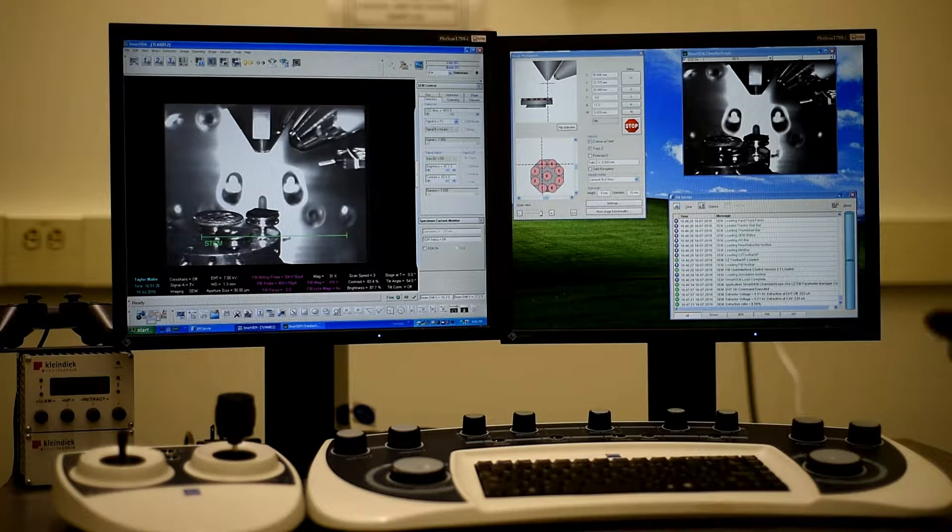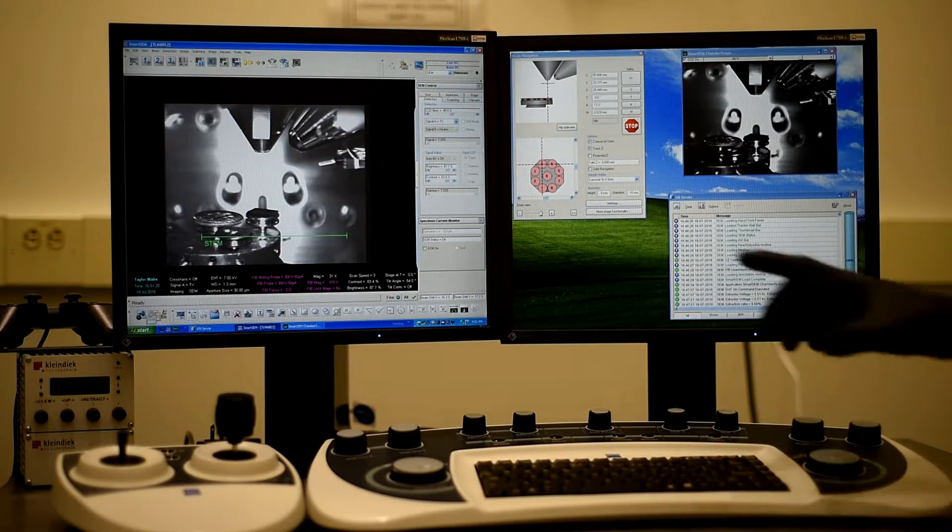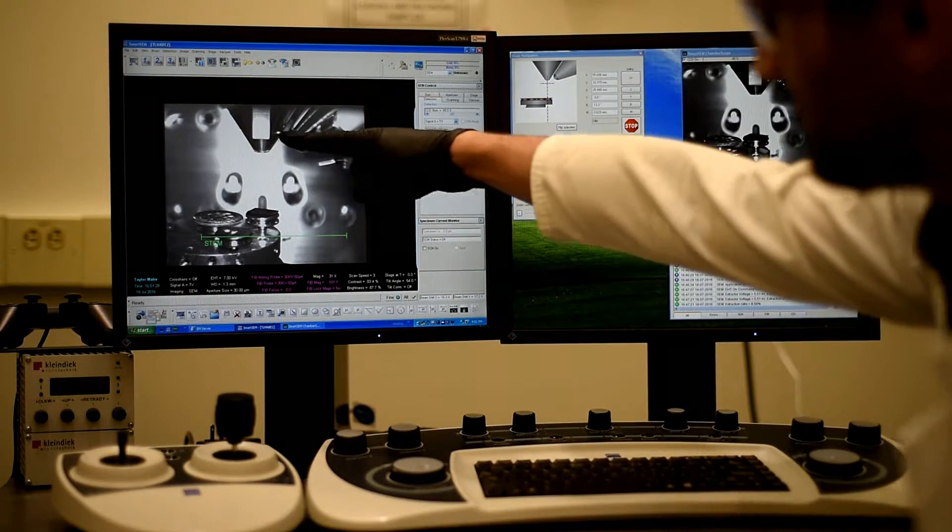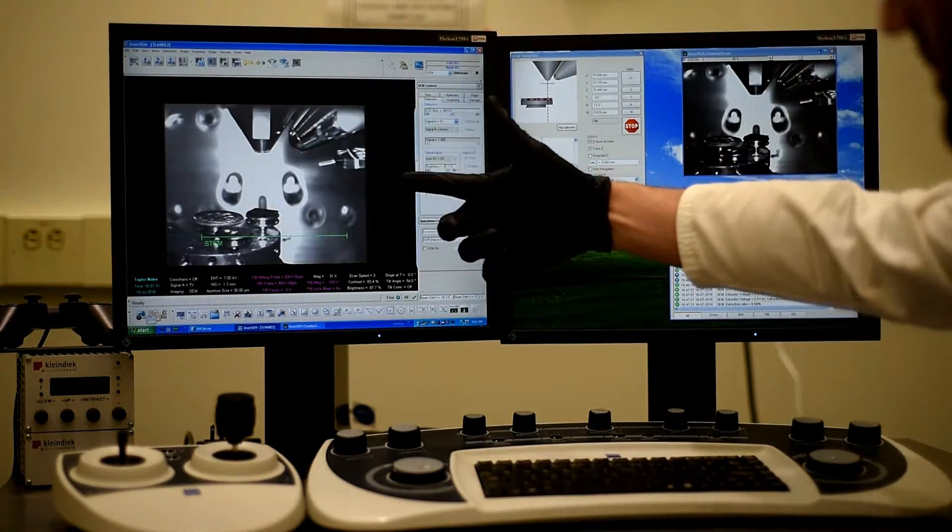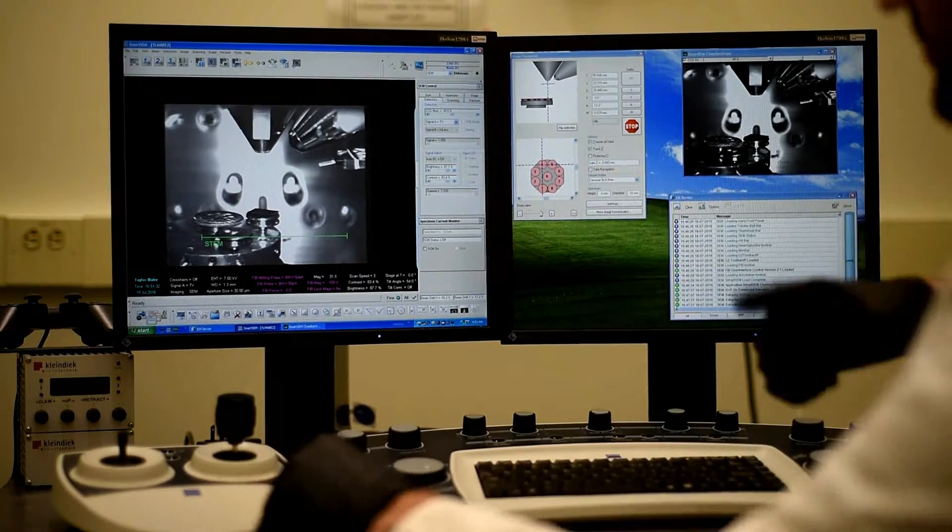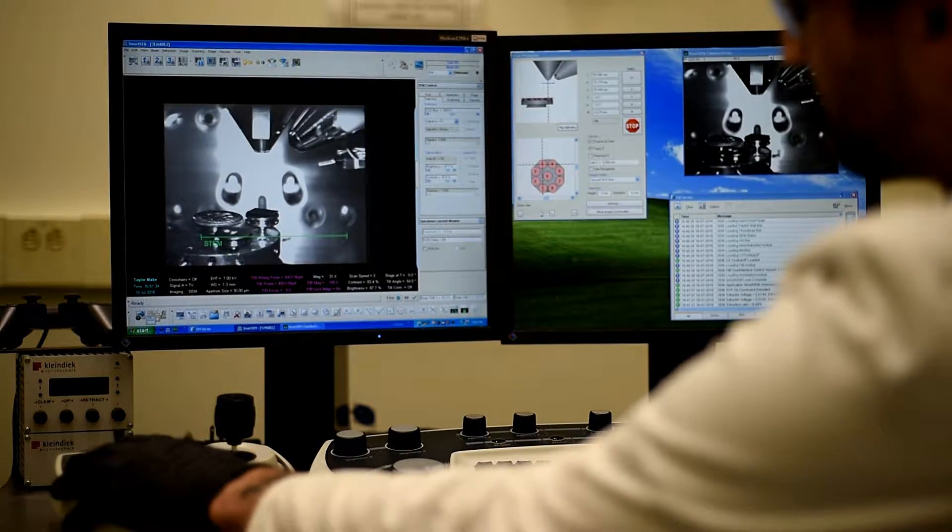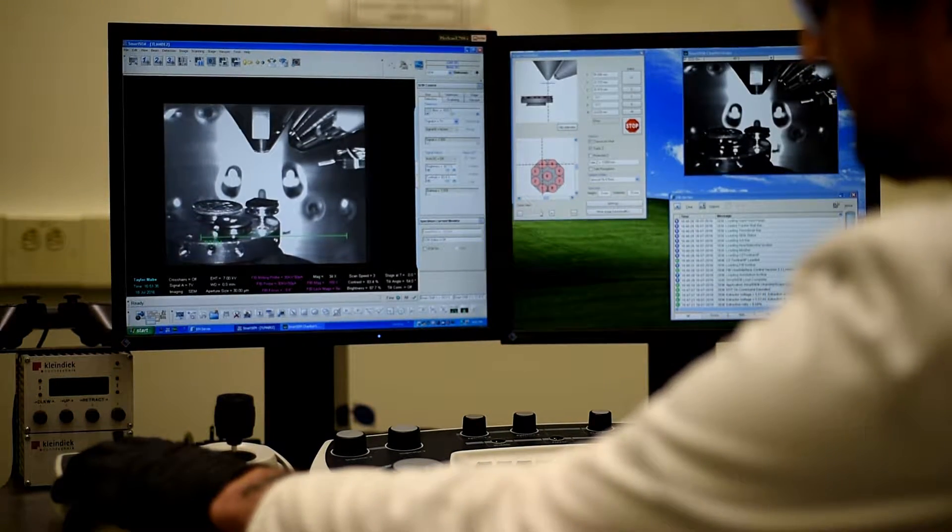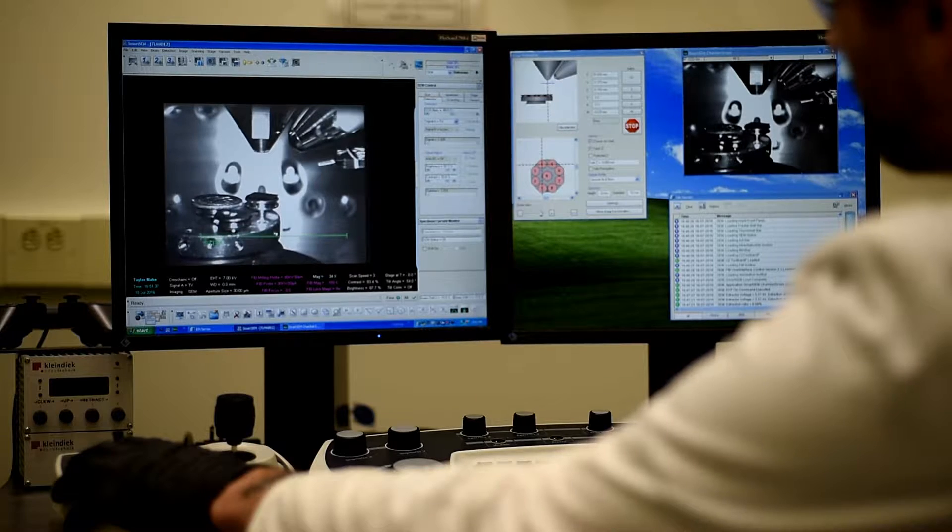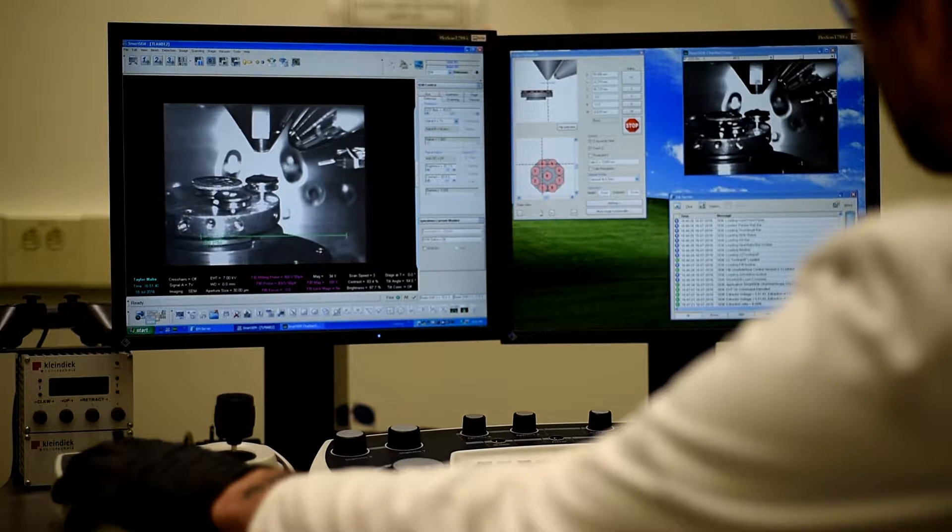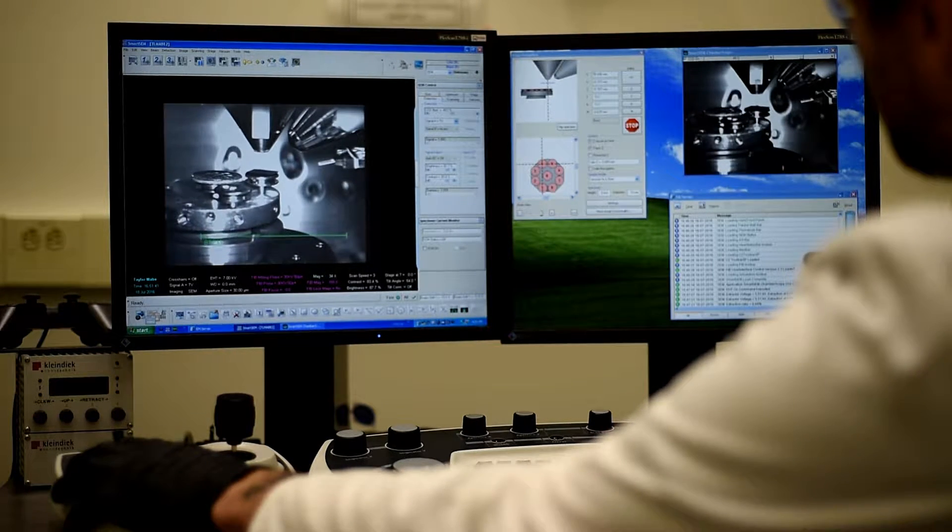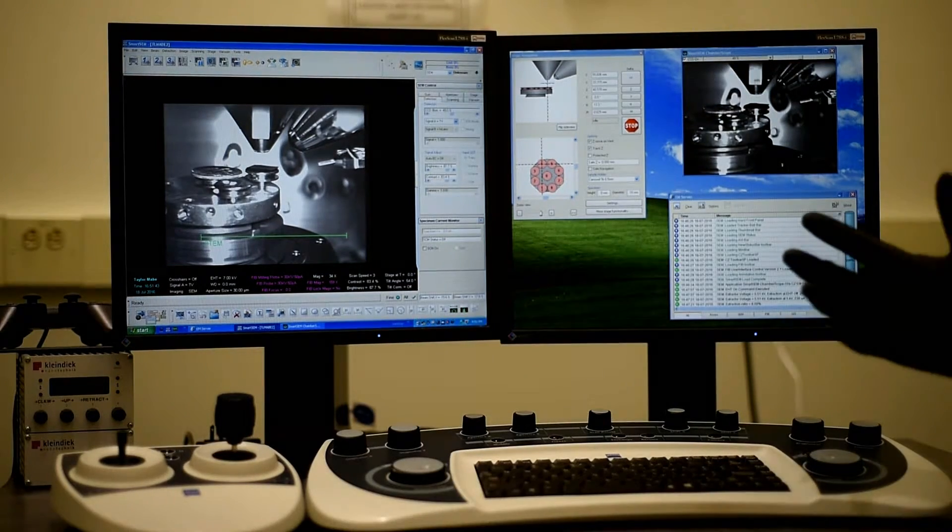So the first thing I'm going to do is, if you look on the screen, the working distance is way too large. So I'm going to decrease that by raising the sample holder. So generally, about 5 millimeters is a good value.